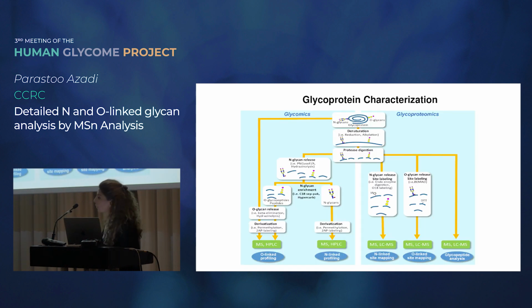For today's talk, I'm only going to concentrate on glycoproteins, on that side of the slide. Everything on that side is what I'm going to show today. So basically, I'll cover glycomics. At a later stage, maybe next year, I'll come back and tell you about our glycoproteomics efforts and what we're trying to do for enriching for glycoproteins and glycopeptides prior to analysis. For glycan analysis, we can start from tissues or cells or singly purified glycoproteins.